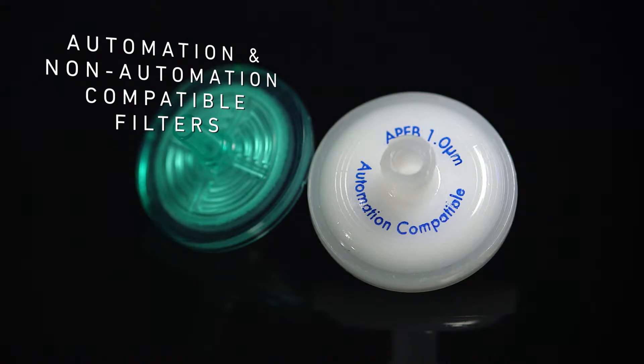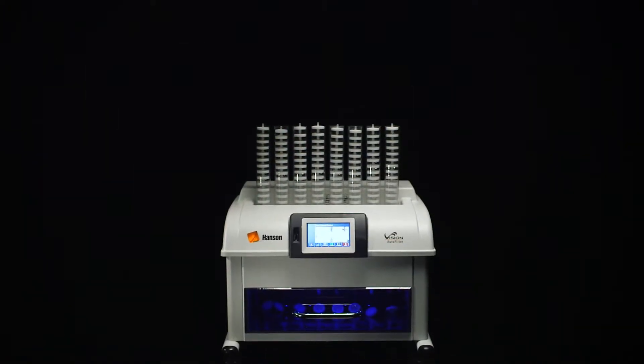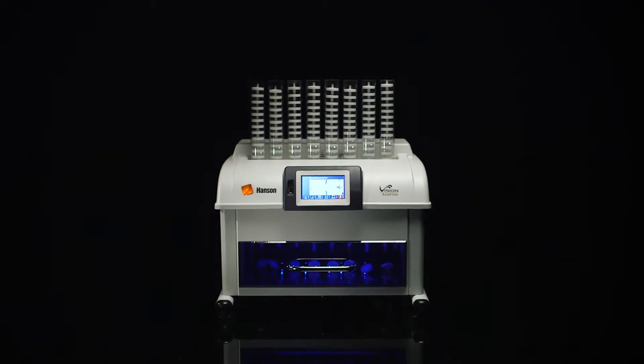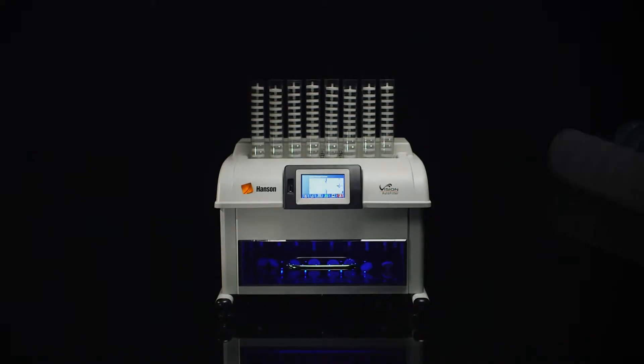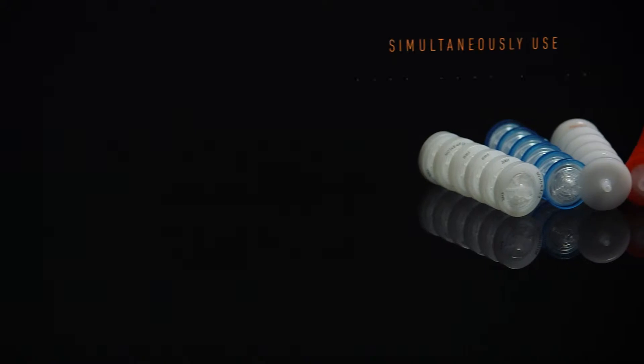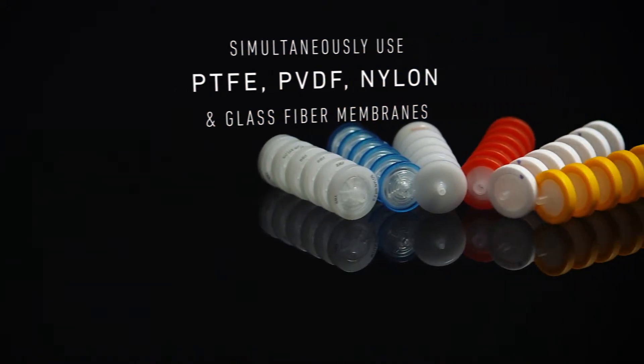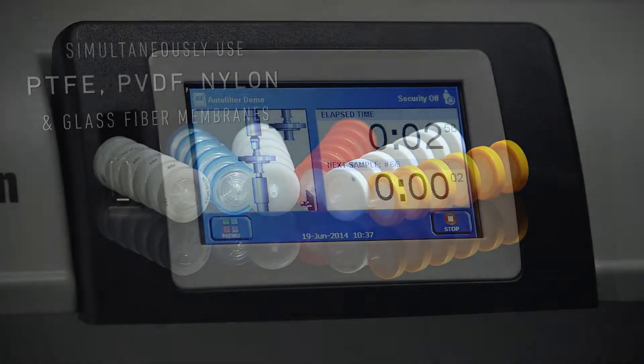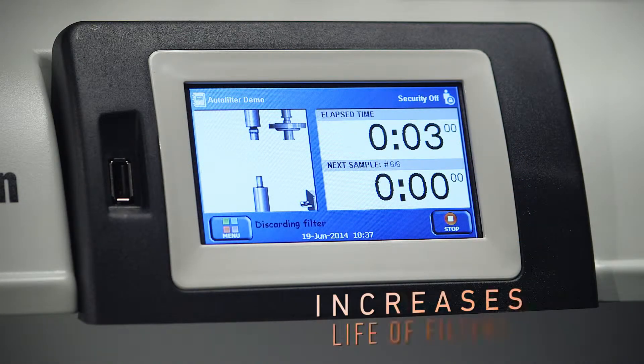Use almost any 25 millimeter filter brand, including automation compatible and non-automation compatible filters. When conducting filter validation studies, the Vision Auto Filter Changer can save valuable time by simultaneously using a variety of filter membrane types.